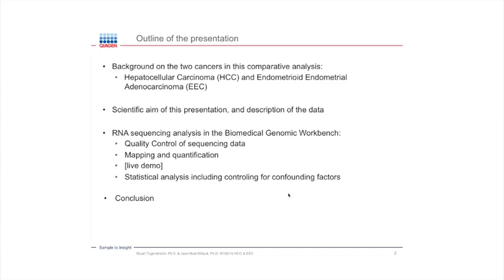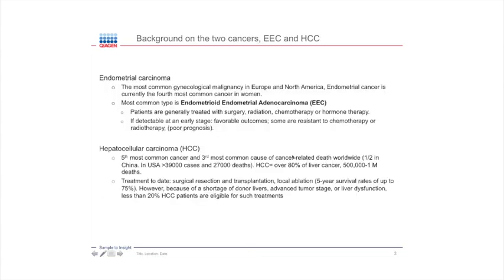And for the sake of keeping the number of switchovers very short, what I'm going to do is talk about the quality control and the mapping, then do the demo of everything, and then switch back into the presentation to explain just what I've shown you in terms of the statistical analysis. And then we'll wrap up with a conclusion, and there should be hopefully about 10 minutes left after that for questions.